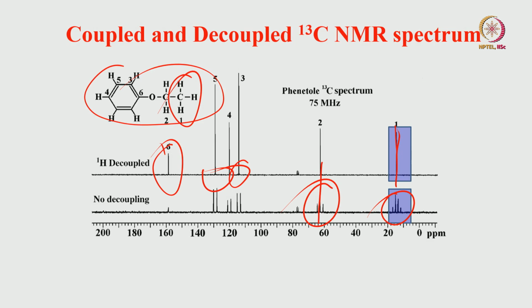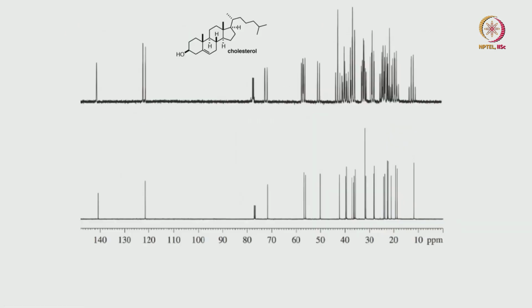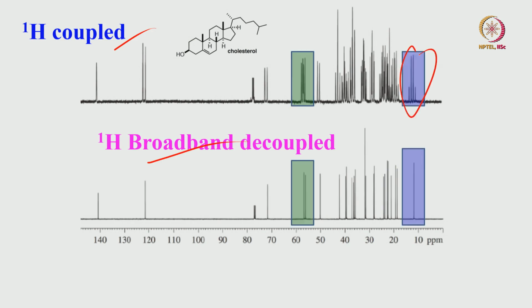If you want to go further here, you can see the changes we see here. A more important thing I showed you is in the cholesterol molecule. This is where you see this was the quartet, this is coupled and this is broadband decoupled. Look at this, this is the quartet. This is okay, a doublet. I can understand this also as a doublet.